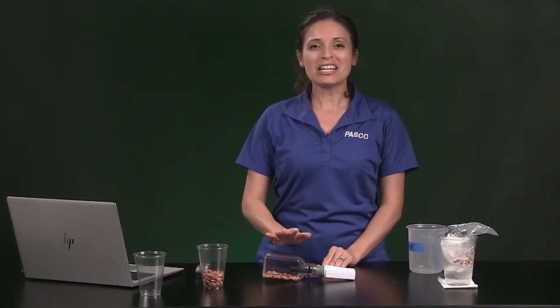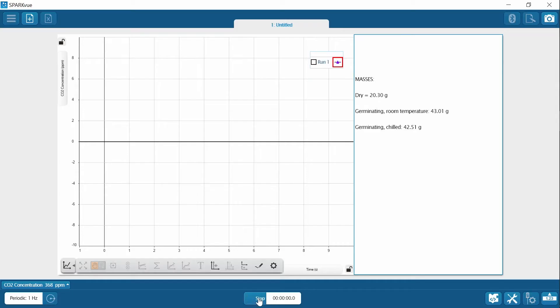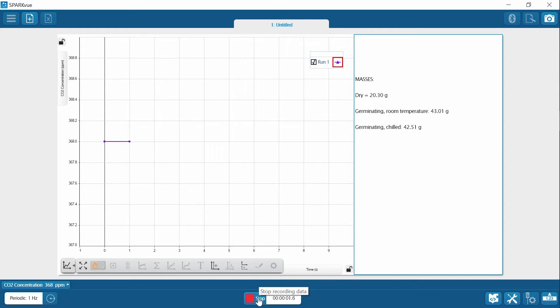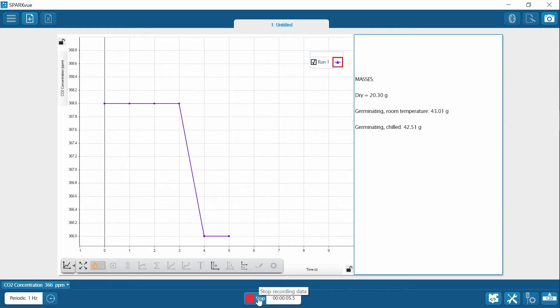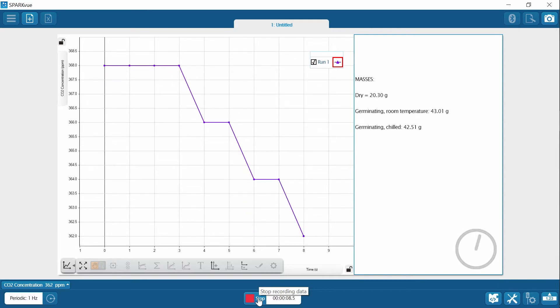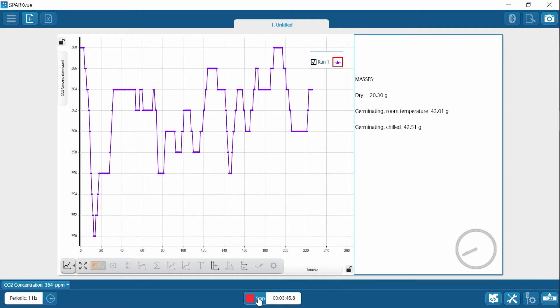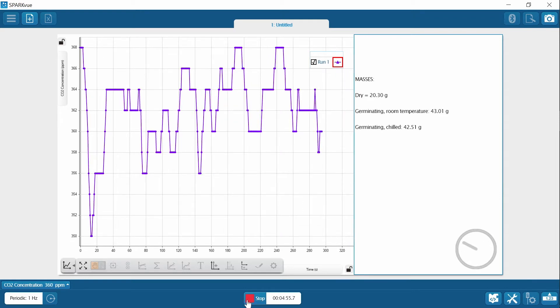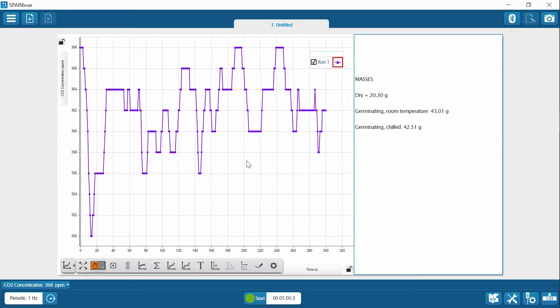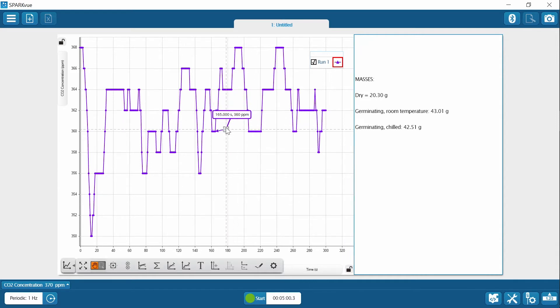I'm going to start collecting data. I've got to make sure that I don't disturb the system during data collection. I'll be collecting data for five minutes, but we will fast forward through data collection for you. Use SparkView tools to find the initial and final carbon dioxide concentration and record the results. This is the coordinate tool — when I put a coordinate tool, I can grab the gray box and move it to any point that I want. I'm going to erase it by hitting the X.